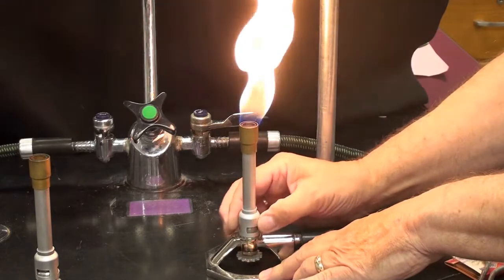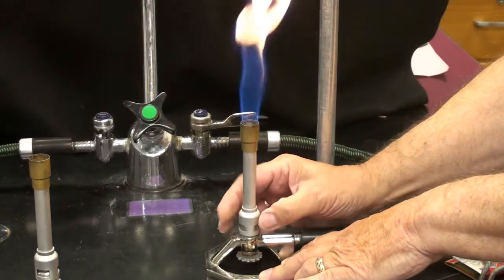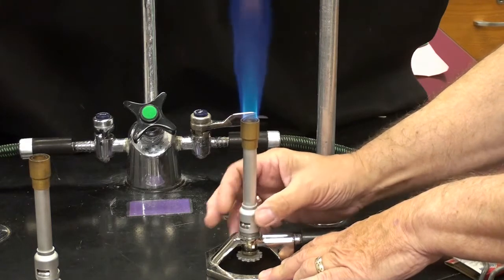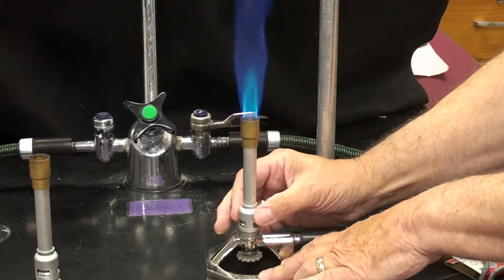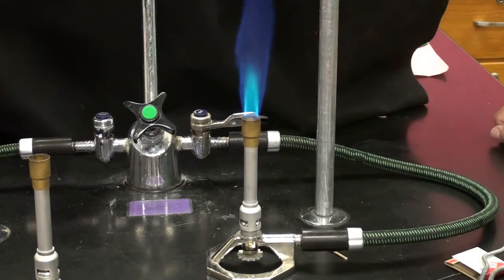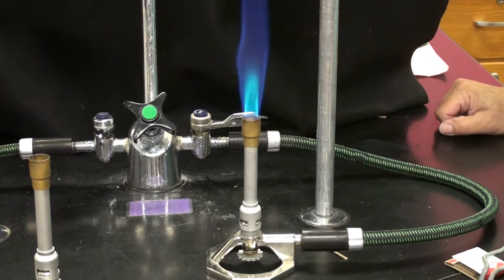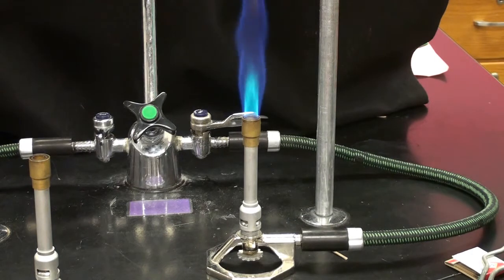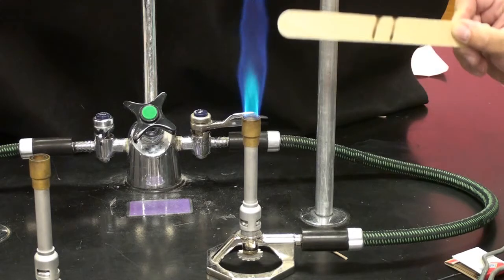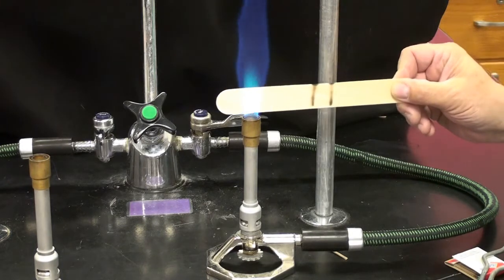Let's try opening up with the other flame. So what I'm doing is I'm opening up now, trying to get that little blue inner cone, if you can see that blue inner cone there. And what I always try to tell students is look for a place above that blue inner cone, and that's usually a hot zone. But we should test it and find out.